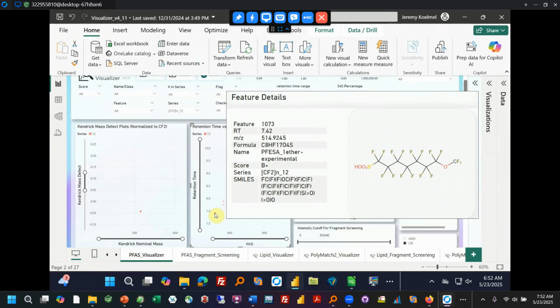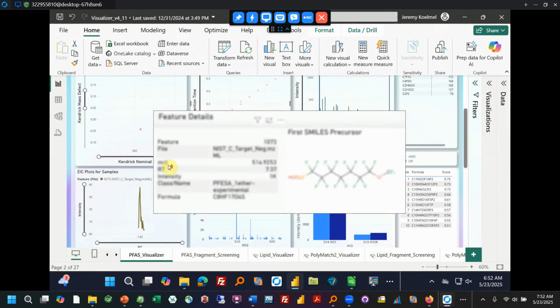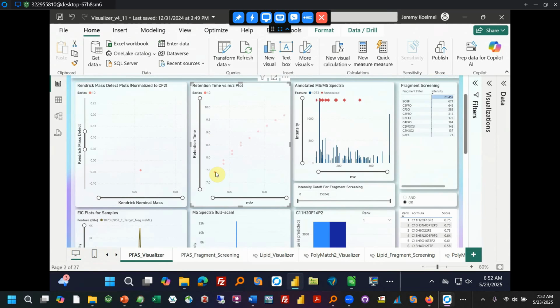And so we can put that into our notes if we wanted to know the exact isomers. In this case, I won't, just for time's sake, and it just depends on the time and the depth you want to go in. You could say, okay, we know what the predominant isomers are, and that even though we are only seeing one peak really here, there are multiple ether linkages in the species, and so the species actually is 1, 2, 3, 4 species, not one.